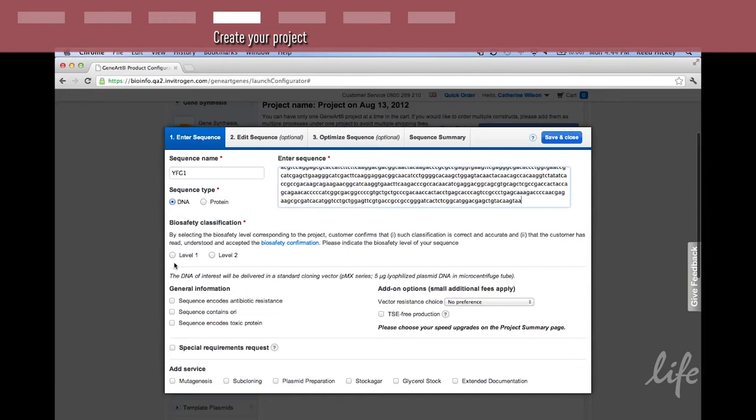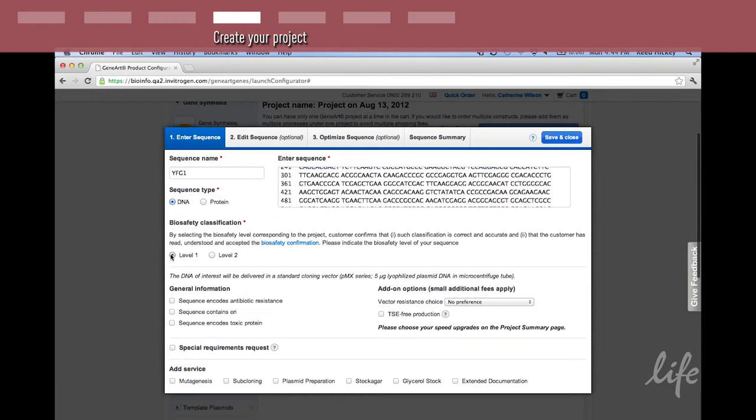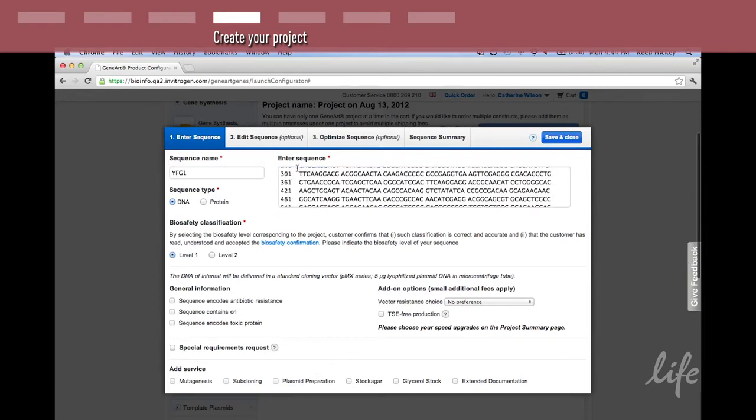Select your biosafety level. If you don't know it, select one. Proceed to the next step.